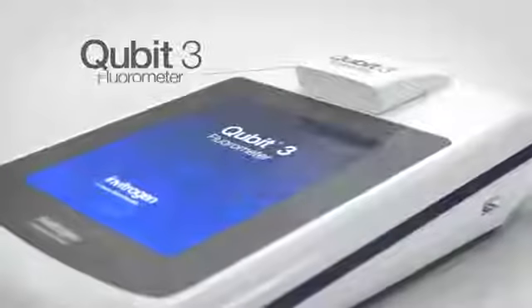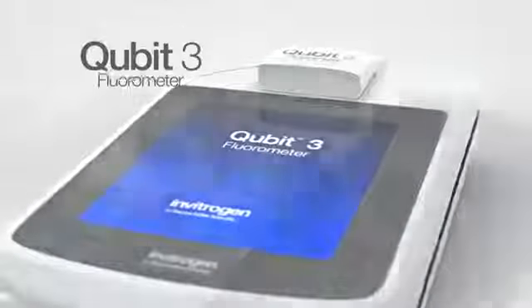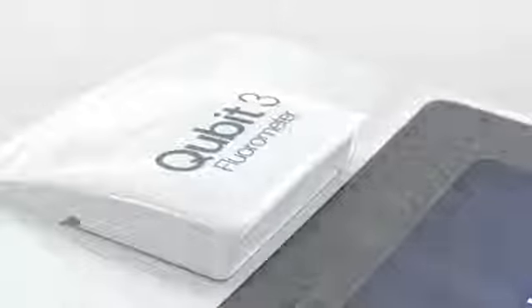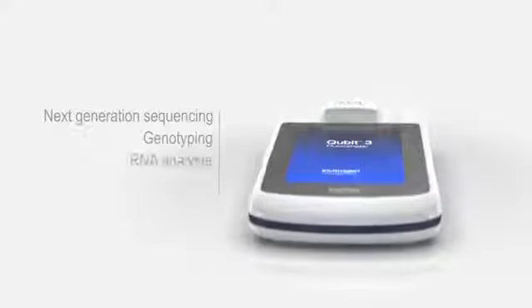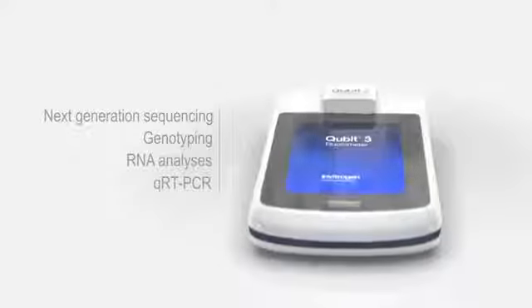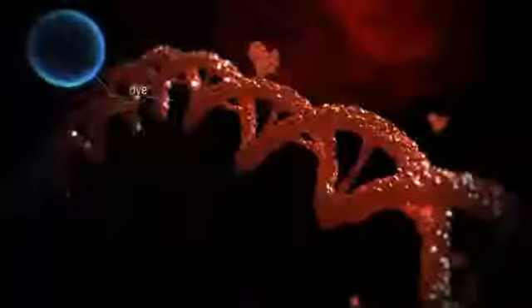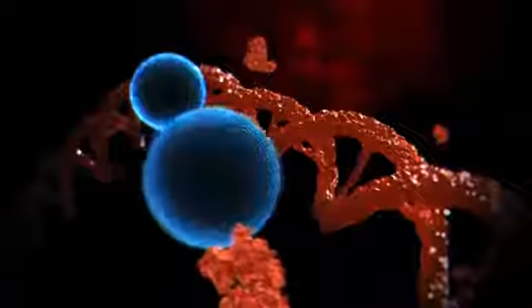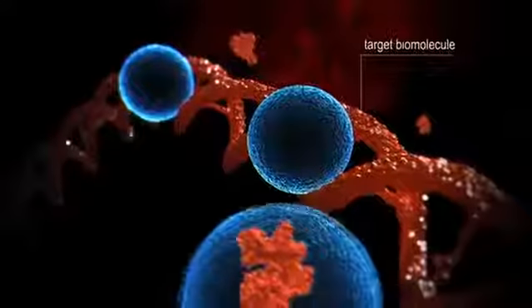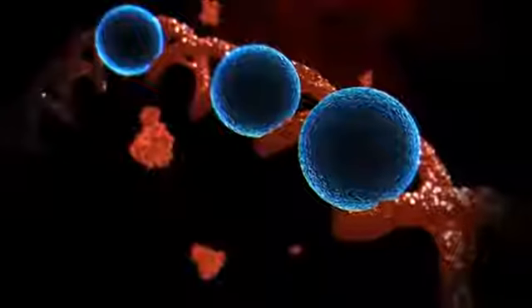The Qubit 3 fluorometer is designed for quantitation of dilute or precious samples that are used in applications, including next-generation sequencing, genotyping, RNA analysis, and quantitative RT-PCR. The Qubit fluorometer uses dyes selective for the biomolecule of interest. These dyes fluoresce when bound to the target biomolecule. The system does not detect other molecules that may be present in the sample.